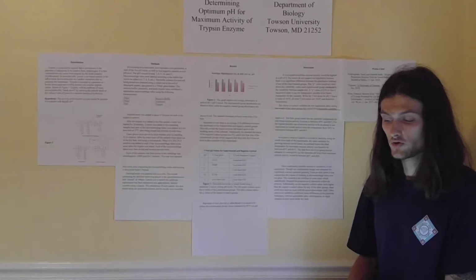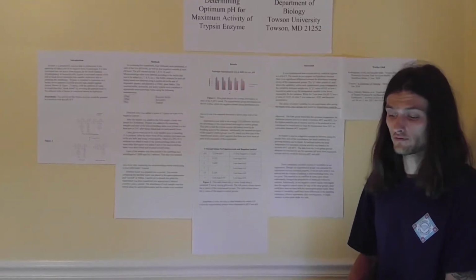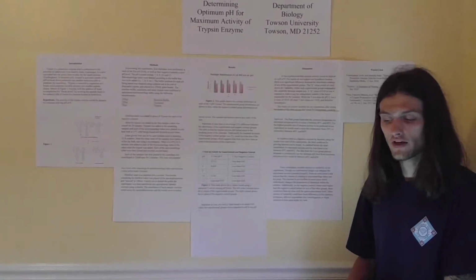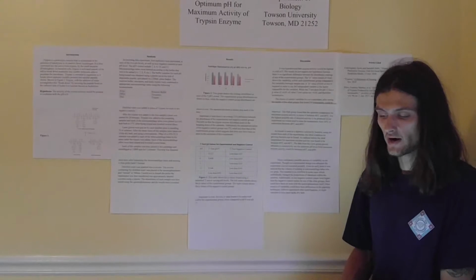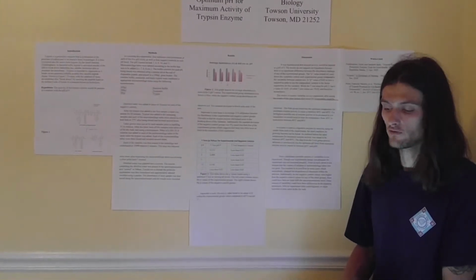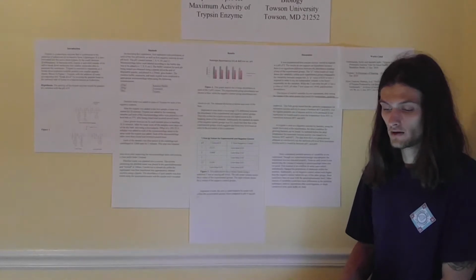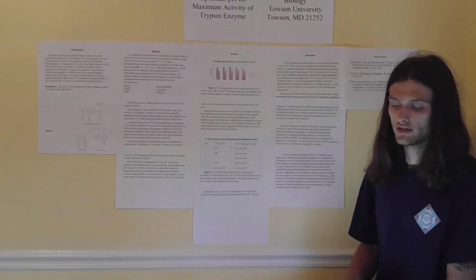Each of the microcentrifuge tubes were then closed and inverted several times for further mixture. Each of the samples were then placed in the centrifuge and centrifuged at 12,000 RPM for 2 minutes. This step was repeated once more after inspecting the microcentrifuge tubes and noticing that a clear pellet hadn't formed. Centrifugation was necessary as it precipitates the remaining substrate. What is left in the supernatant is smaller peptide chains broken down by the trypsin.